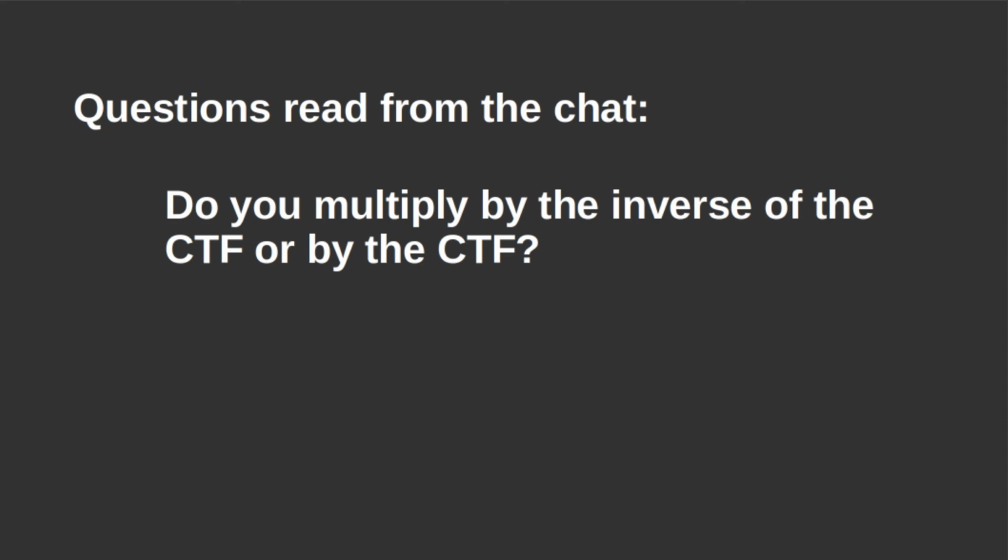Thank you, Beata. Asking for a thick sample, the data collected by an electron microscope is a projection of the sample. When a computer tries to slice it and assign different defocus values to each slice, how does a computer know where a signal comes from? Does it require images at different series of angles to retrieve this information?